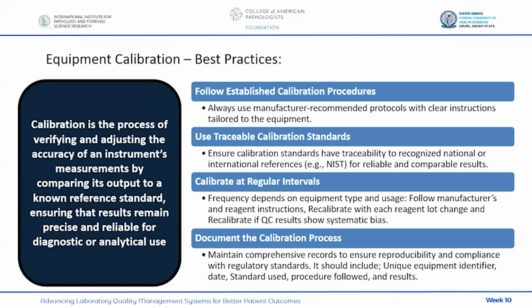It's equally important to calibrate at regular intervals. The frequency of calibration depends on the equipment type and your usage. Follow the manufacturer's instructions, also the reagent's instructions. And there are instances where you need to calibrate. Following manufacturer's instructions, the manufacturer can say calibrate at these intervals.